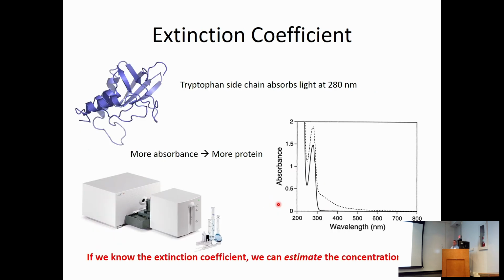And then finally, the big one is extinction coefficient. And this one's so important that I have a little bit of experimental data here because I often find that students joining my lab will measure the extinction coefficient or measure a protein concentration, but maybe not measure it correctly. And so here, tryptophan has a very unique feature in that it absorbs light at 280 nanometers. And not much else absorbs down there, right? Some tyrosine absorbs a little bit there, but everything else is very, very low.